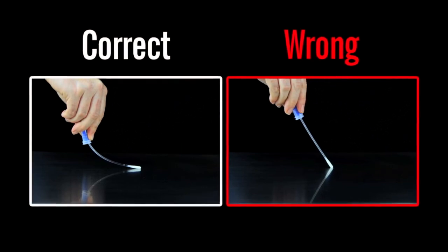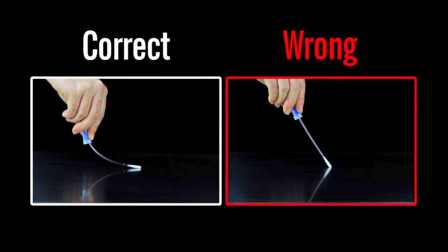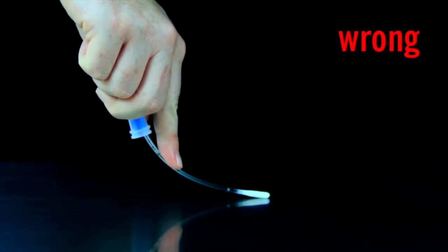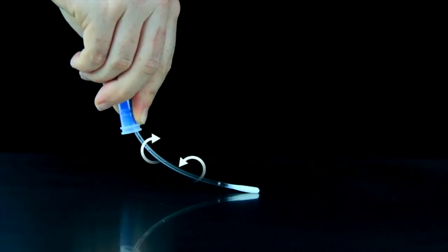This maximizes sample collection and improves accuracy of test results. Be sure not to touch the swab shaft while collecting sample. Touching the swab shaft contaminates the test and will produce inaccurate results. Rotate the swab tip while collecting sample to ensure maximum sample collection.